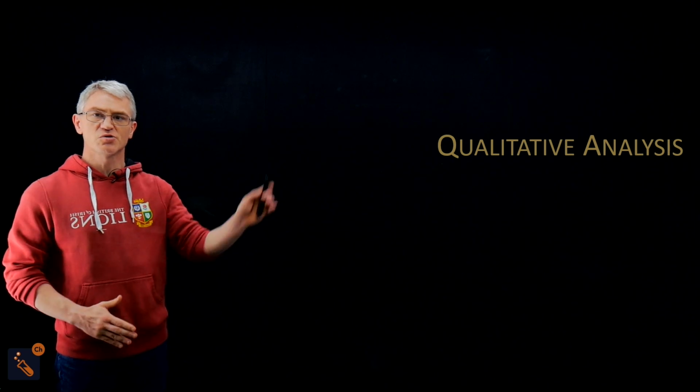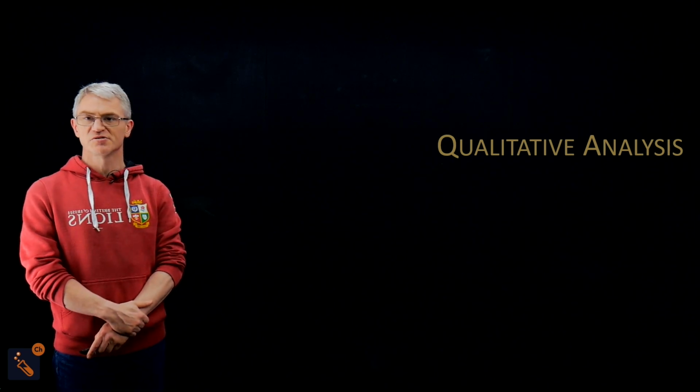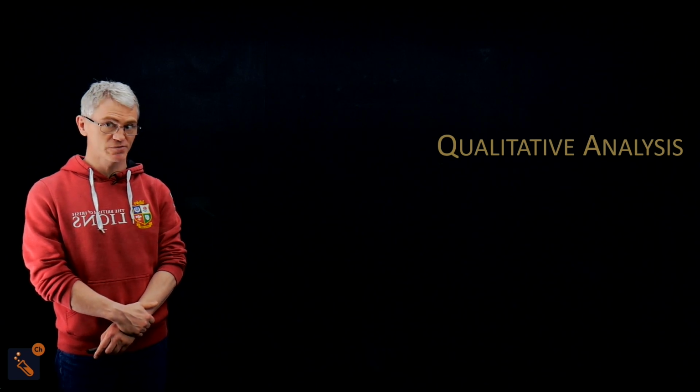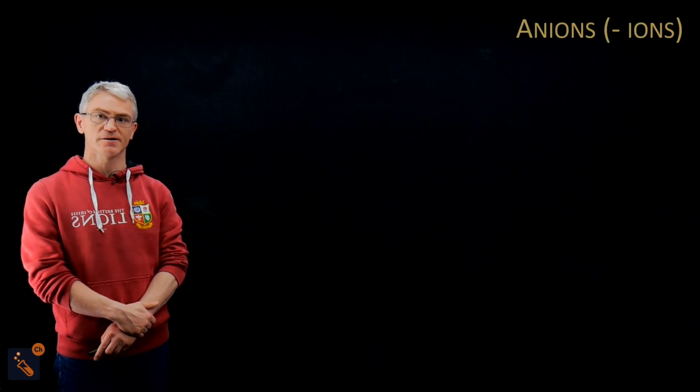In this video, we're going to do qualitative analysis. We're going to go through all the tests for anions and cations and then go through a question at the end, which people find quite difficult. So well worth watching that.